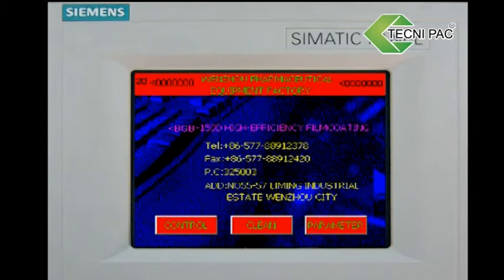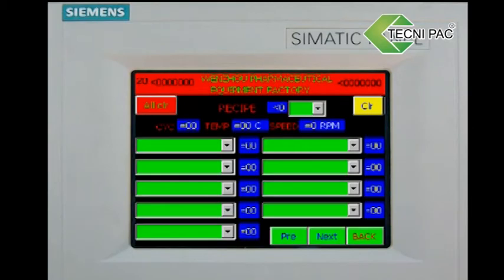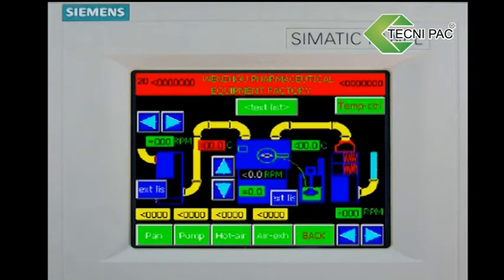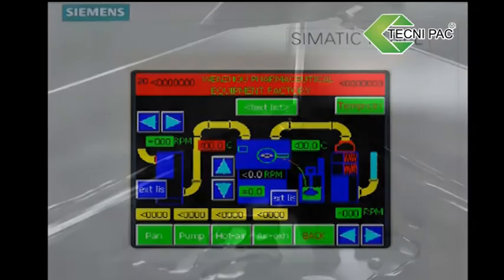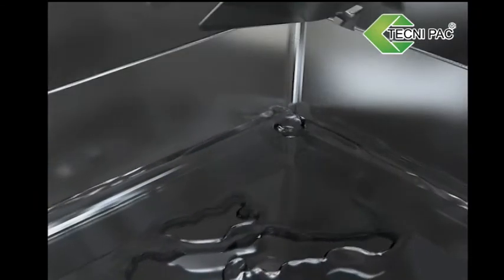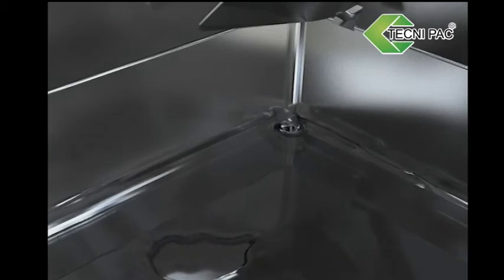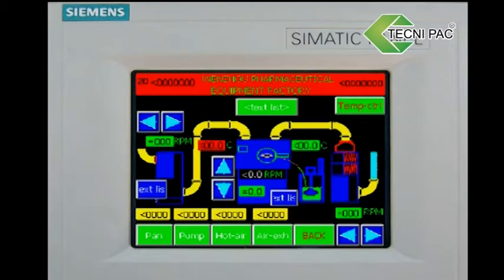CIP Cleaning System Operation. Open the drainage valve of cleaning liquid collecting tank and then start pressure pump to supply 80 degrees Celsius water for one circle of automatic cleaning. Upon completion of prior step, close the pressure pump and corresponding water supply valve. The water inside rinse tank will discharge to the low water level till the level meter sends out the signal of no water, and then the drainage pump of rinse tank will close.